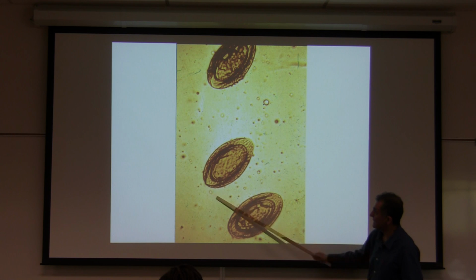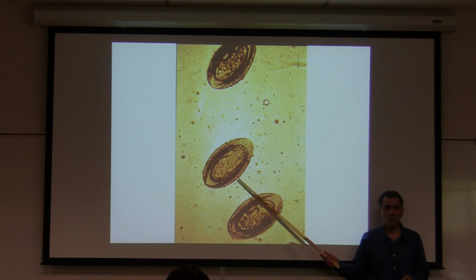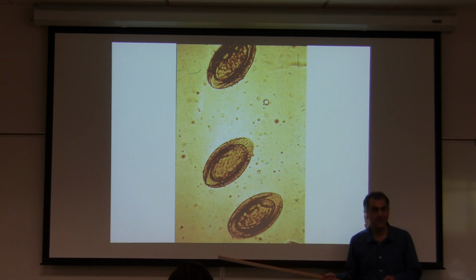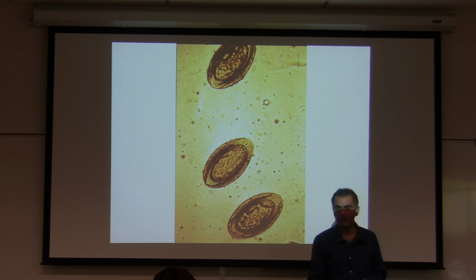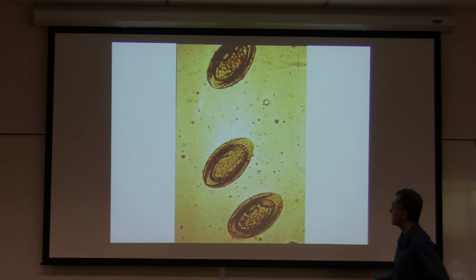Okay, let's warm you up for it. What is the name of the phylum? Acanthocephala. What is the common name? Spiny-headed worm. What is the name of the organism? Macracanthorhynchus hirudinaceus. Look at some old exams; I have asked that. Say, oh, it's too long, I'm not going to ask that. No, I have asked that. Okay, so those are the eggs.